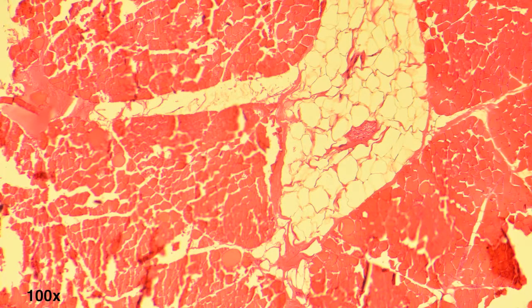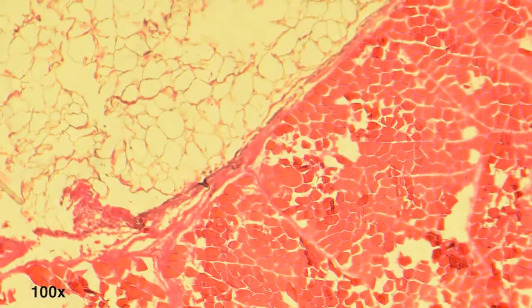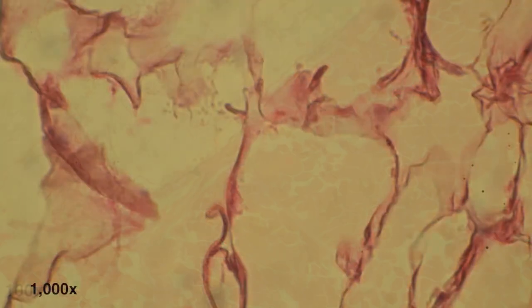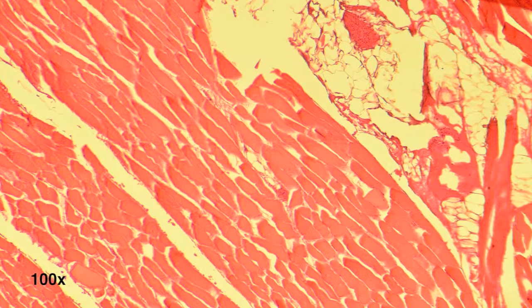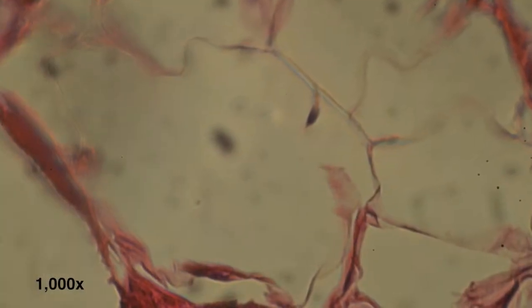Next, we see a sample from the rare steak. Notice a slight increase in muscle bundle fragmentation and abnormal adipocyte structure. By medium, we see this pattern continuing as more water is lost and the adipocytes begin to lyse. And finally, with well done, the water is totally lost and the adipocytes are completely lysed.